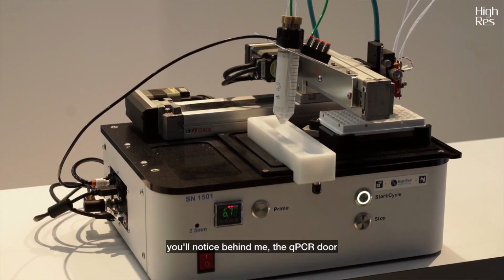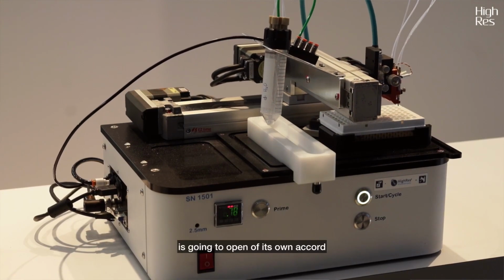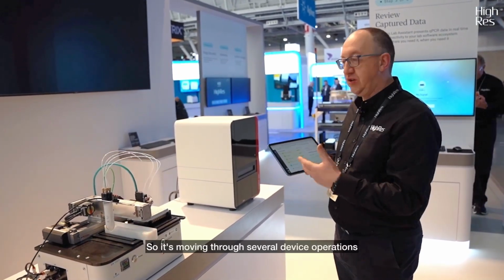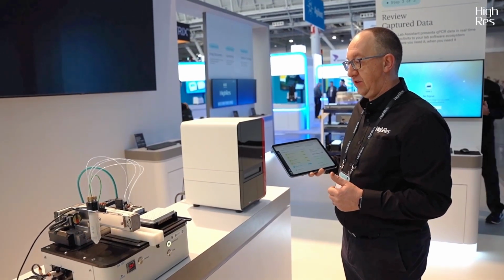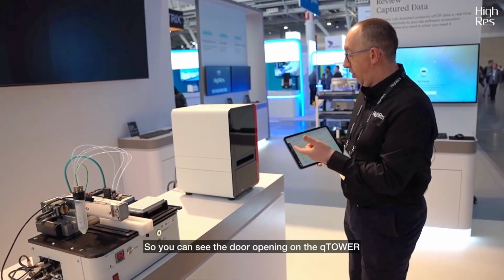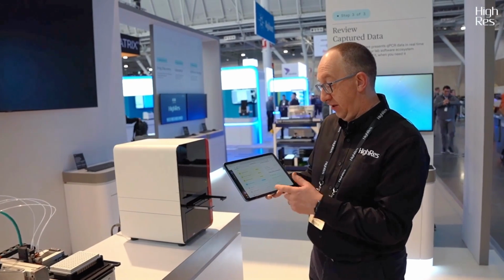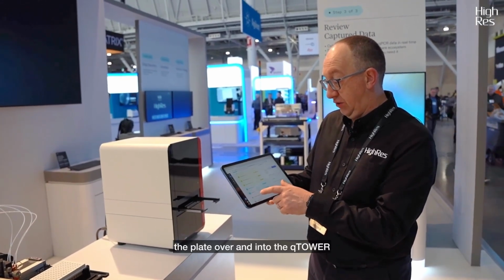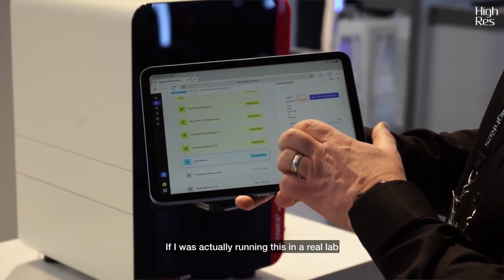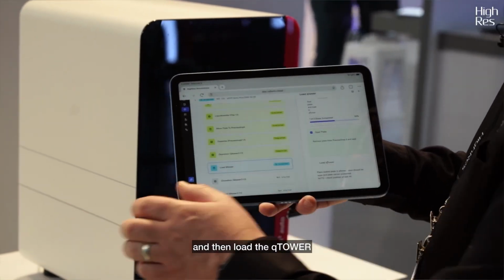Once that's finished, you'll notice behind me, the qPCR door, which is a fully automated instrument, is going to open of its own accord, ready to receive that particular plate. So it's moving through several device operations automatically back to back. So it should just do that now. So you can see the door opening on the qTower, and then it's going to ask me to go through the manual operation of moving the plate over and into the qTower. So again, I start my operation. If I was actually running this in a real lab, I would seal my plate and then load the qTower.